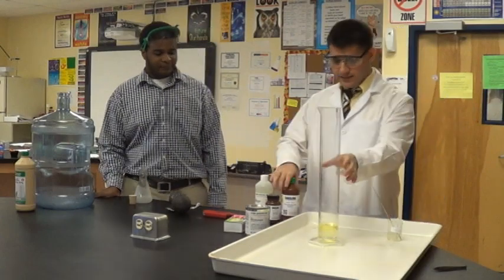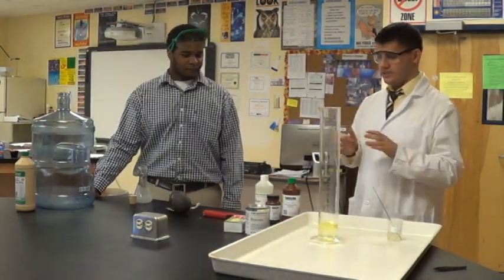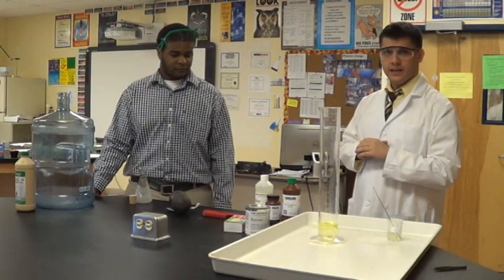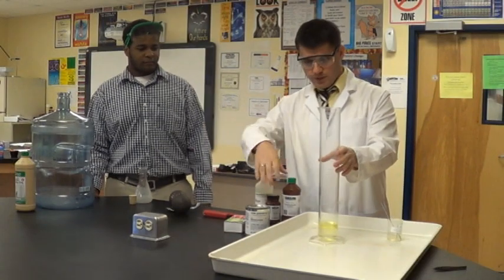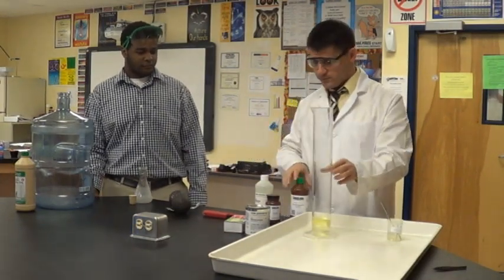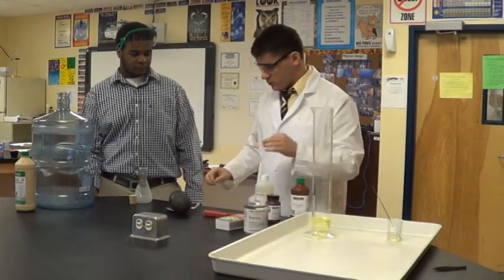Sure. So, I assigned AP chemistry students an AP chemistry project, and there are like 27 projects online, and we are going to perform four experiments today. The first experiment we are going to show today is elephant toothpaste, and the second one is going to be called carbide cannon.